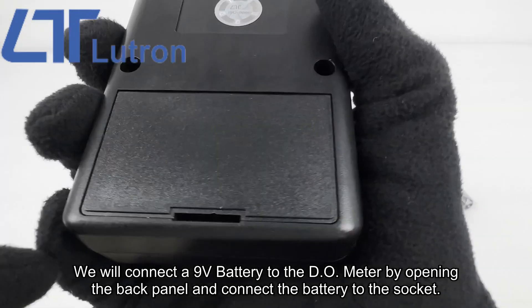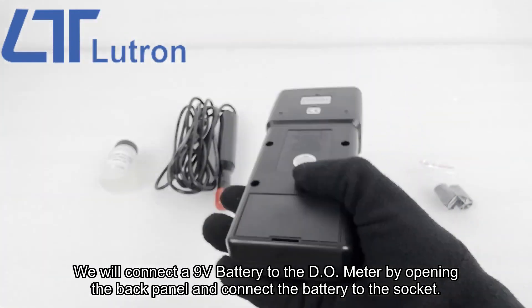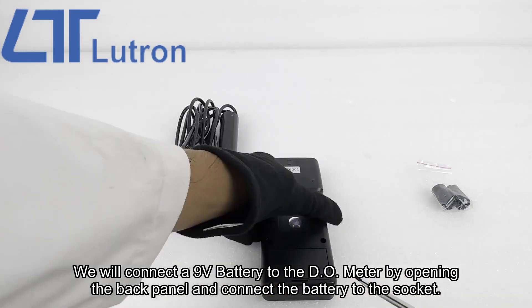We will connect a 9V battery to the DO meter by opening the back panel and connecting the battery to the socket.